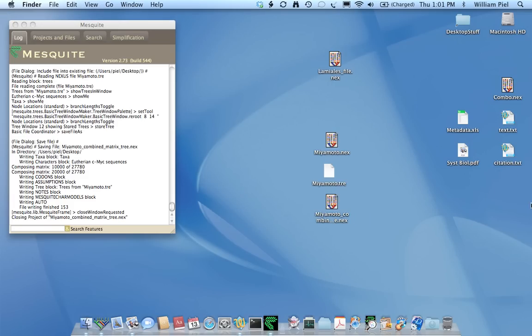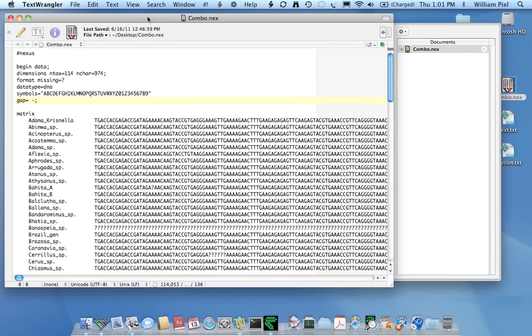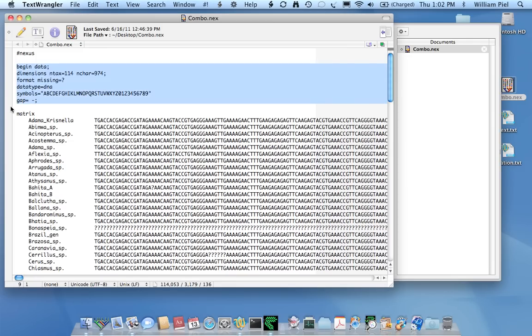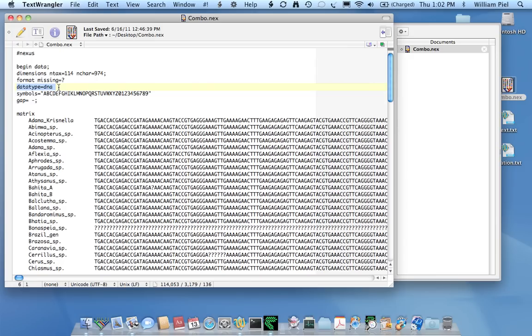Now, I'll show you a common Nexus file that is submitted to TreeBase. This one, it's called Combo. I see this quite frequently. And it's a problem because there's ambiguity in the formatting of this Nexus file. Here, for example, we see that the format or the data type, I should say, is called DNA. However, the symbols have been defined and that is an ambiguous and confusing situation. Because when data type is called DNA, the assumption is that IUPAC symbols are being used to express the DNA sequences.